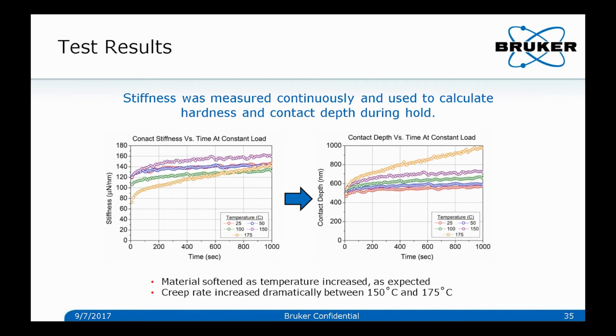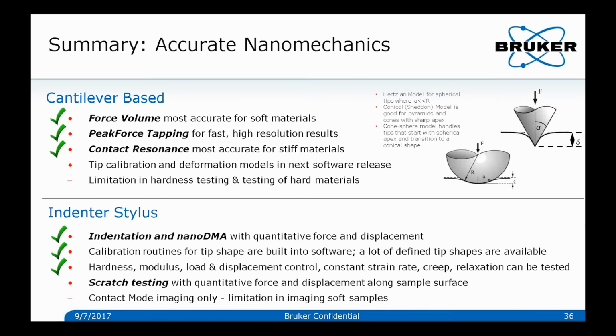So you're enabling some creep mechanism. The deformation behavior of the solder is beginning to change, and you're enabling much higher creep rates within the solder. So you can do this as a function of temperature as well. And you can also fit this to different models, like an exponential decay function, and determine time constants.